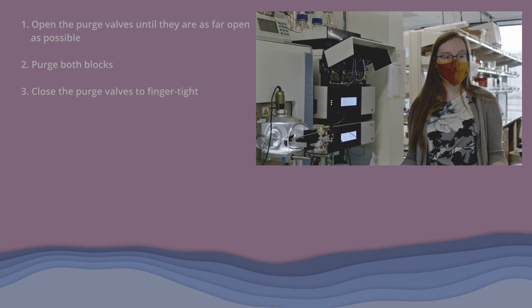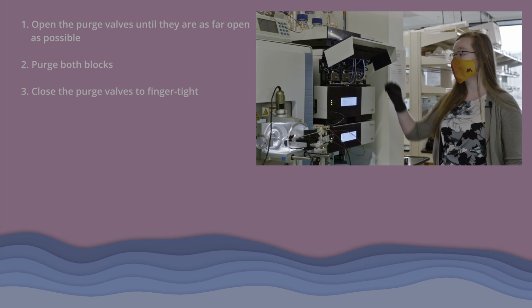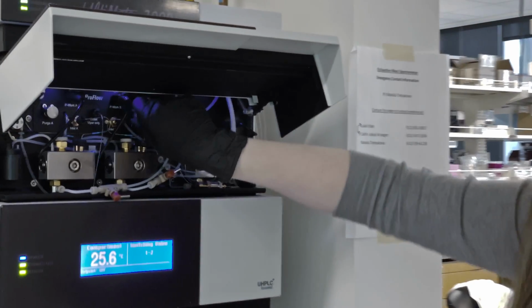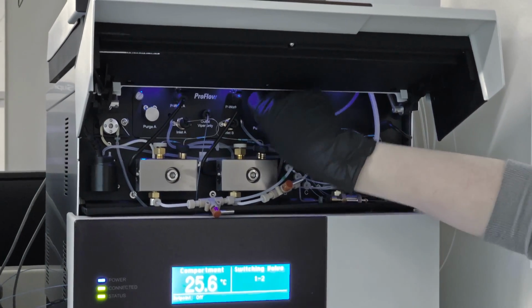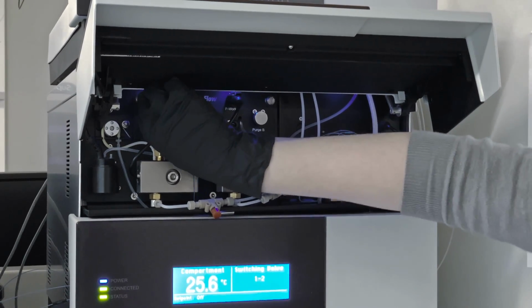Once the block's purge has concluded, you'll want to come back to the pump and close the purge valves. When you close these, make sure that they're finger tight. I like to tell people that if I can't open them after you close them, you've closed them too tight. Over-tightening them can lead to damage.